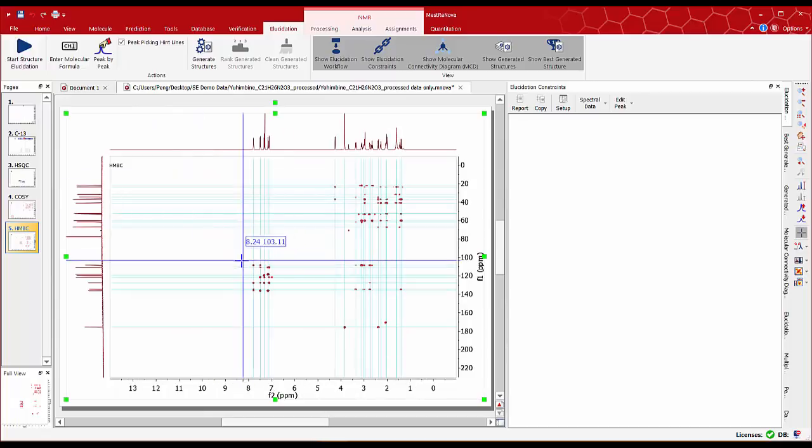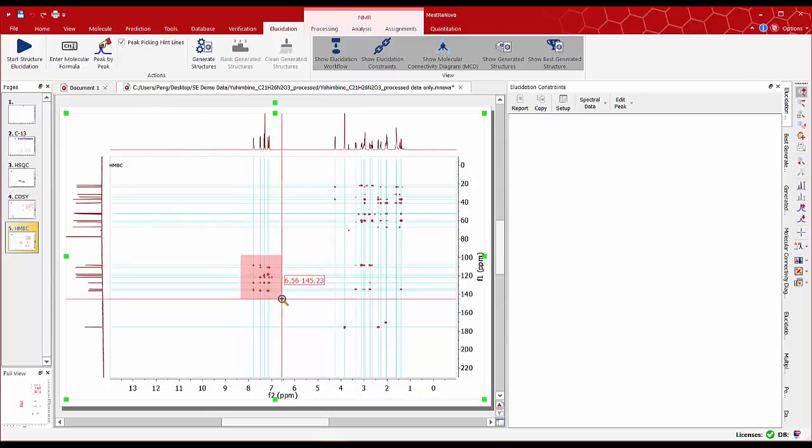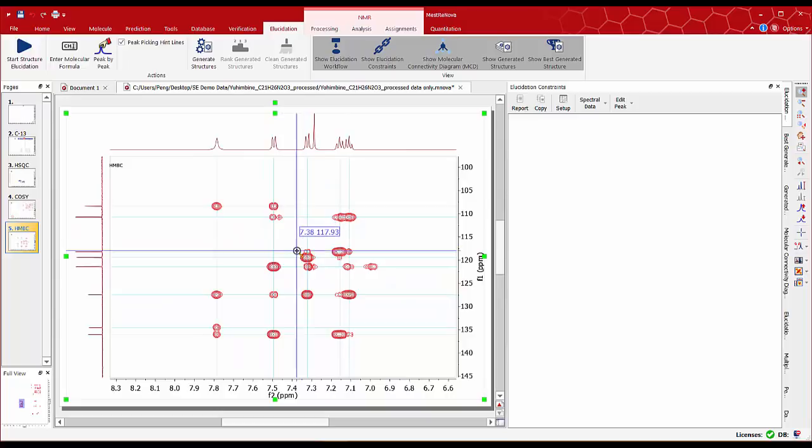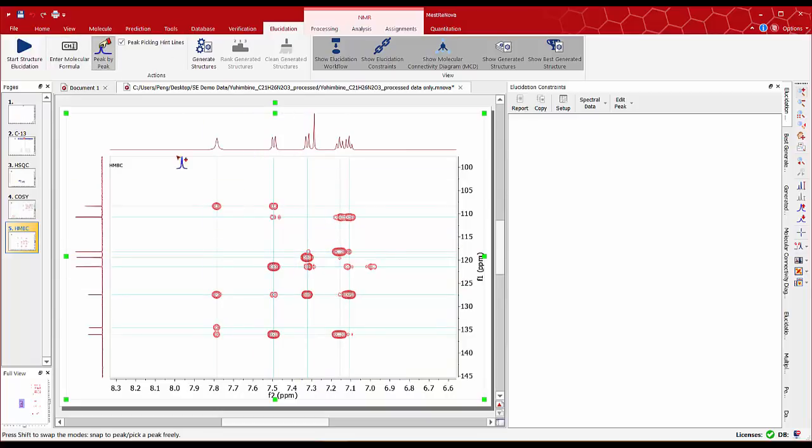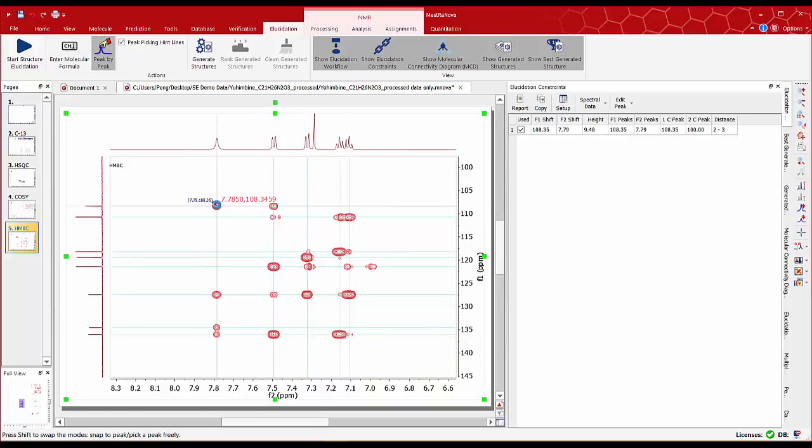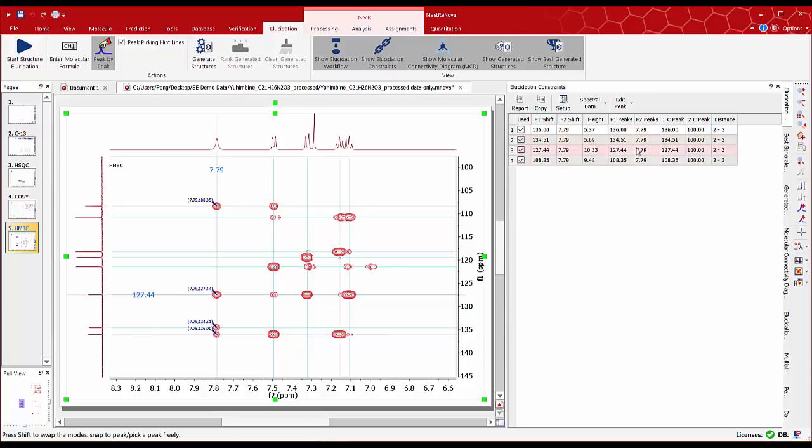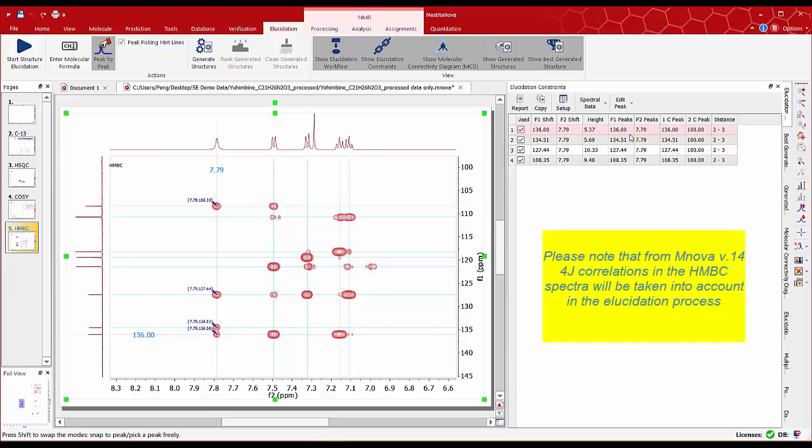Moving on we can analyse the HMBC spectra. Starting by the aromatic region we can start doing peak picking on the strong correlations and see the details for each correlation on the constraint table. MNOVA structure elucidation currently only uses the information for 2j and 3j correlations. Long range correlations will be included in this module very soon. For the time being it's important not to include any long range correlations that's 4j or higher for the elucidation process.